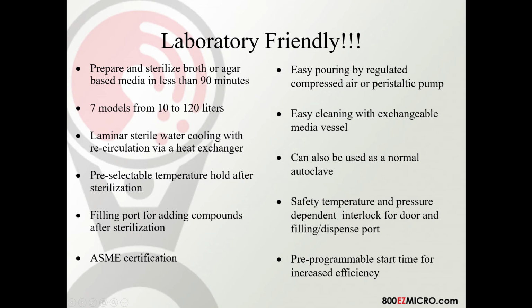So another option that we have is putting compressed air into the instrument and pushing all of the media out of the unit. So if you want to utilize a MediaPrep system for something other than plate pouring, like filling 1-liter bottles or dispensing into a large holding bag, then we can do that as well. There is no option that needs to be purchased. It is standard in the instrument that would allow us to use compressed air to push that media out of there very gently, much faster than a peristaltic pump as well.